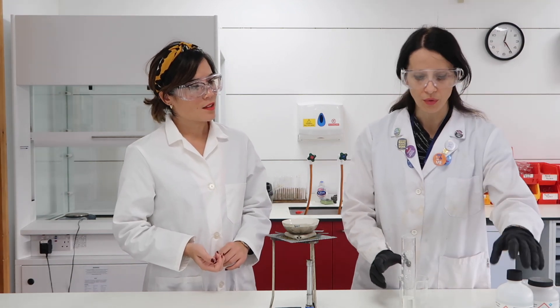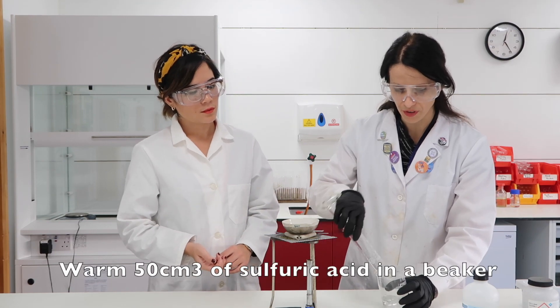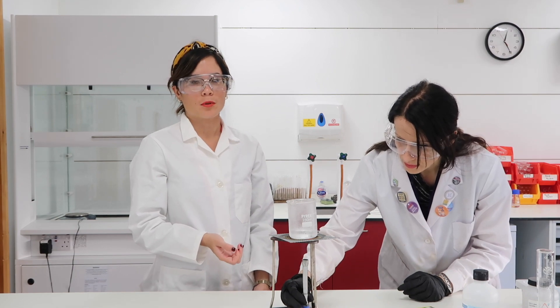Okay, so first of all we're going to put 50 ml — 50 cubic centimetres — of sulfuric acid in the beaker, and then we have to warm it up. We're increasing the temperature of the sulfuric acid to increase the solubility of the copper oxide.